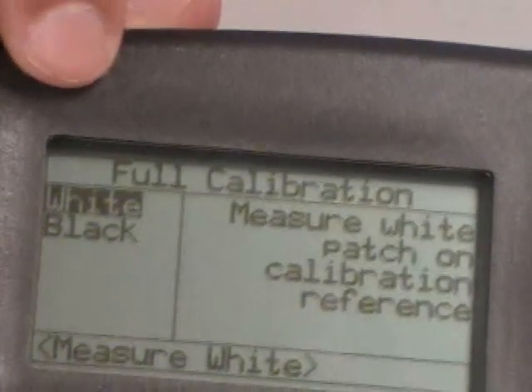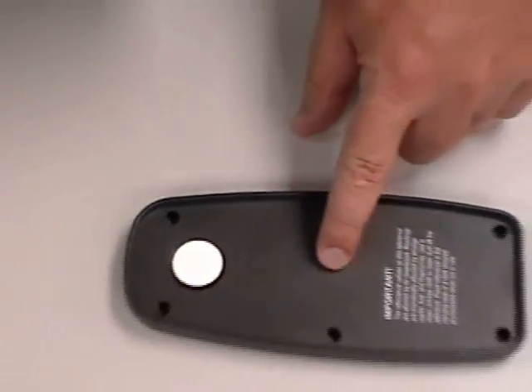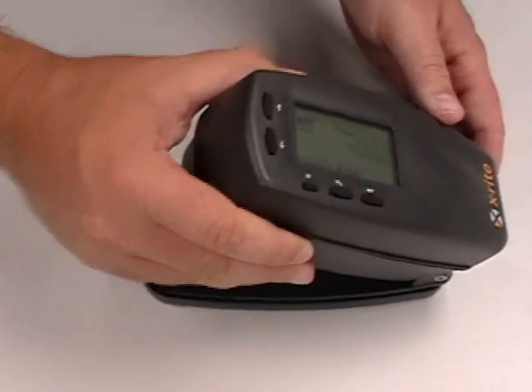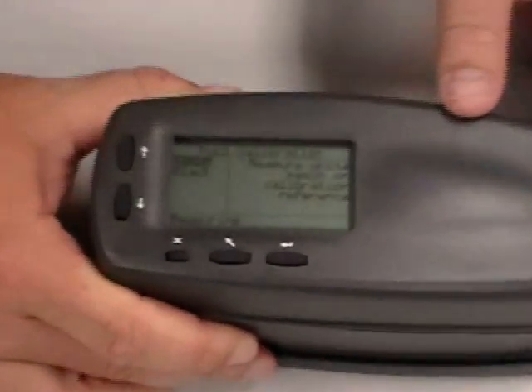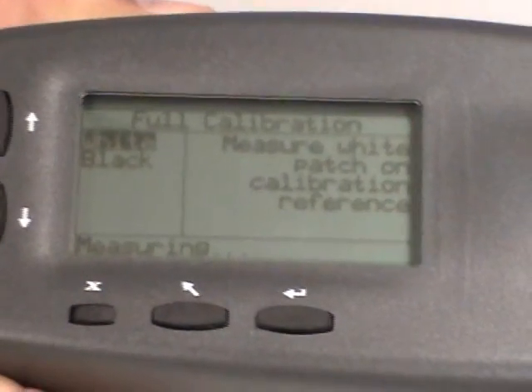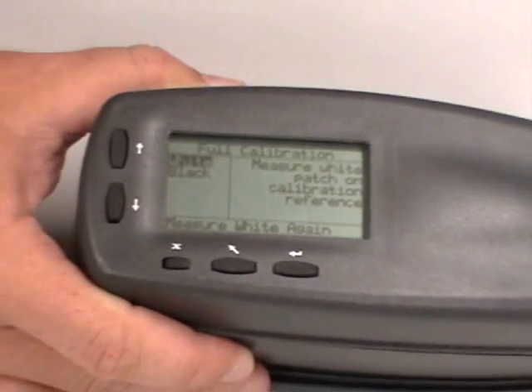Full calibration is going to ask for for white and for black. The white plate is actually located right here. Black will be a null measurement — I'll show you that in a second. Press and hold the instrument down until it actually says complete for the first time. Do so, you release. It will actually tell you to measure white again. Press and hold once again.